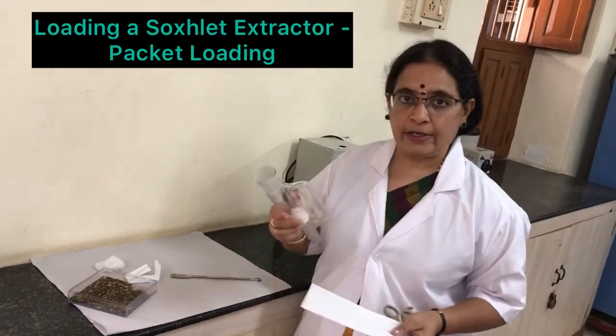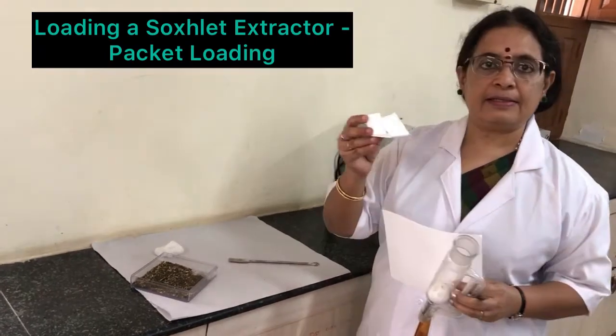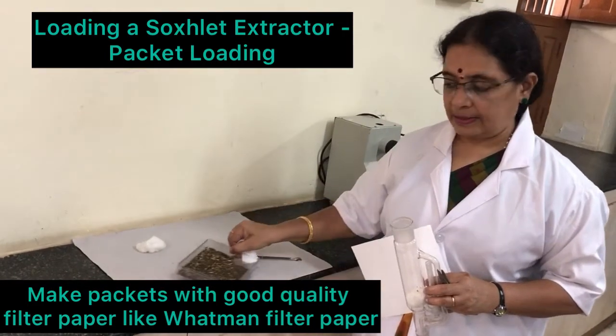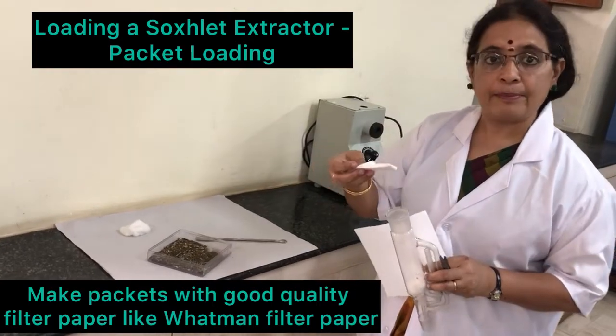Another method of loading the Soxhlet Extractor: you will make packets like this, and inside the packets you will have the plant material, and you can push it inside like this. I will show you how to make the packets.